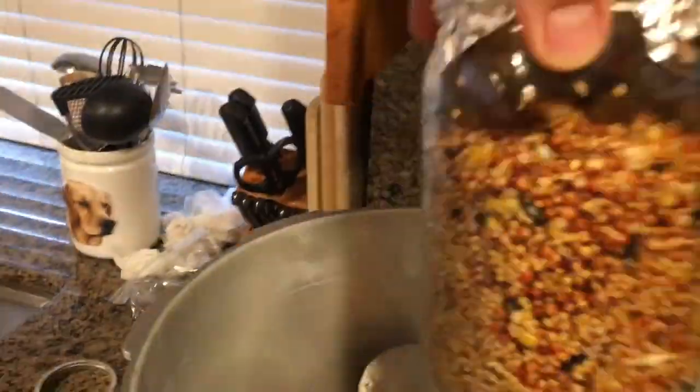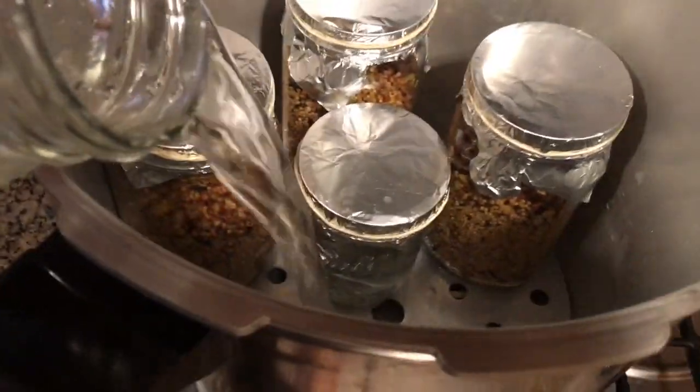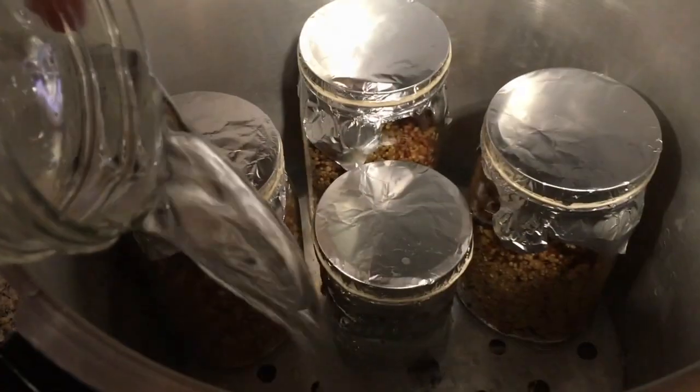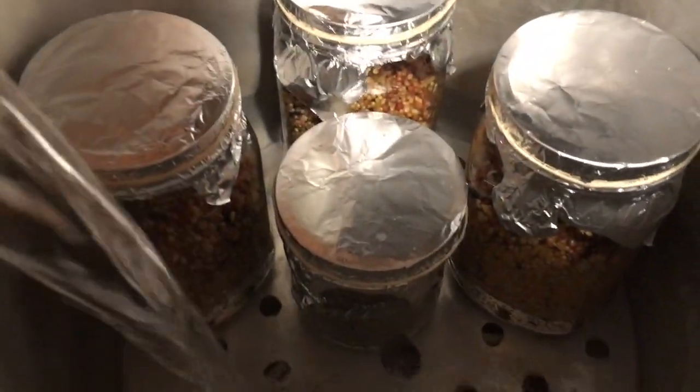Put four rings on the bottom of your pressure cooker, then place the plate that came with your pressure cooker on top of those rings. Now it's time to load your jars. After loading, add clean water into the pressure cooker. Make sure there is no bird seed outside of the jars because we don't want the pressure cooker to get clogged.